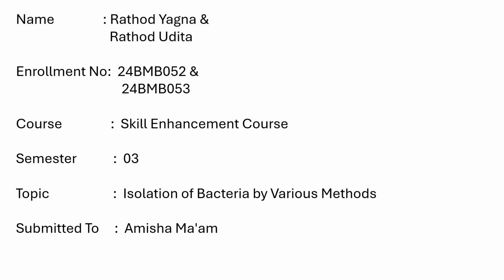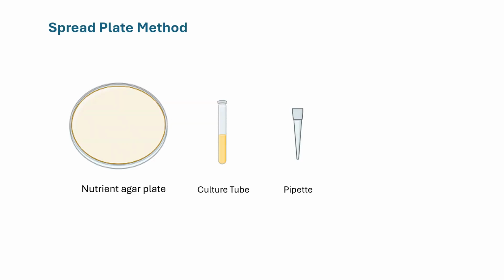I am going to present on the topic of isolation of bacteria by various methods. There are many ways to isolate bacteria. One of the methods is the spread plate method. So, here's the animation of the spread plate method.